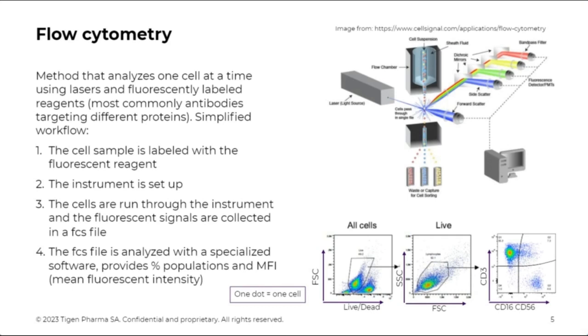In a very simplified workflow, the sample is labeled with a fluorescent reagent, and the instrument needs to be set up according to all the procedures.